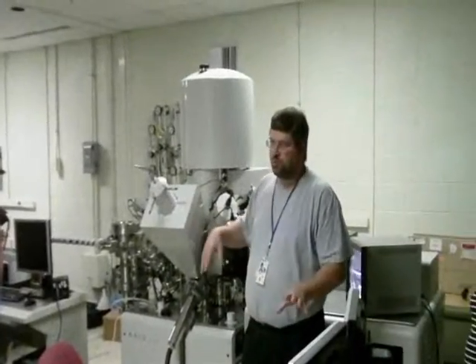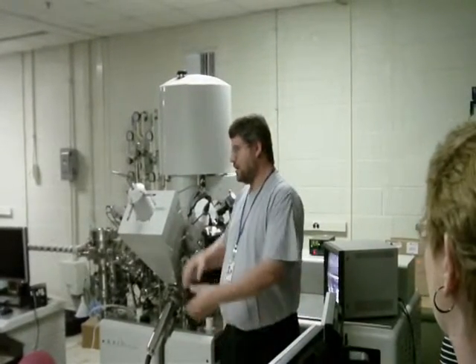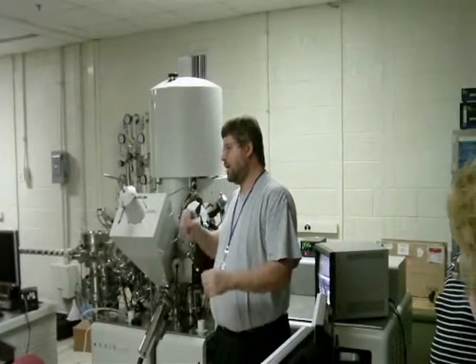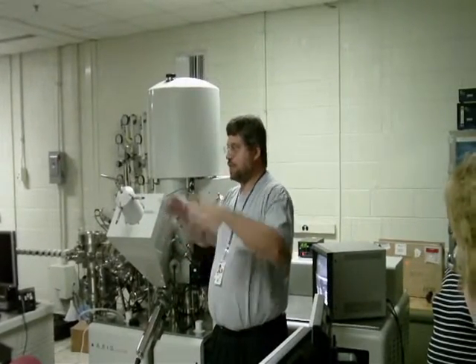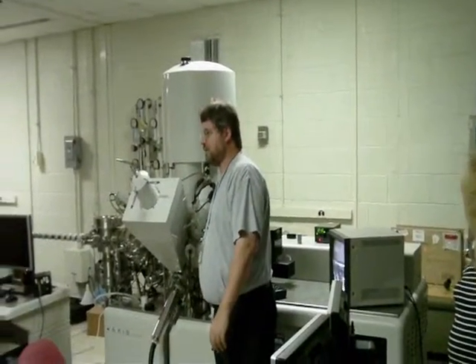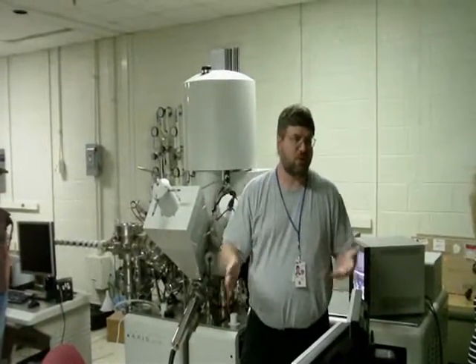The way this particular instrument works is you have an x-ray beam and it hits the surface of a particular material, and the x-rays actually generate electrons. Those electrons then get collected up in this particular detector here, which then can tell us about the surface chemistry of something that we're looking at.